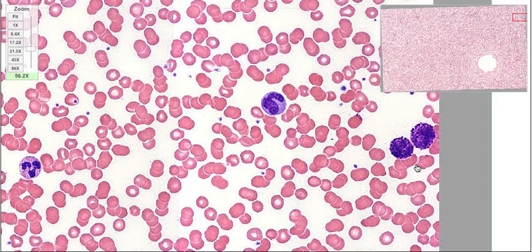Their main function is they're very similar to mast cells. They're jam-packed with histamine, which is used in response to inflammation or to cause inflammation. But essentially you don't find mast cells within the blood. You find mast cells within connective tissues, and they respond to infections. But these guys will typically withdraw from the blood and essentially act like a mast cell, but they're only found in the blood, whilst mast cells are found within the connective tissues.